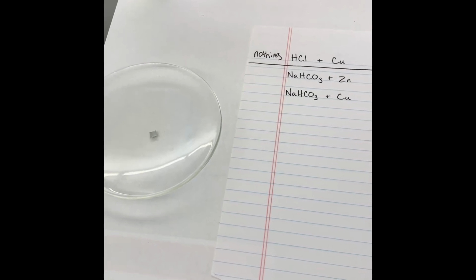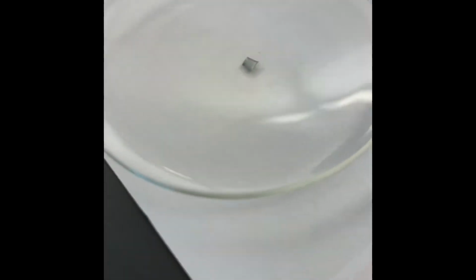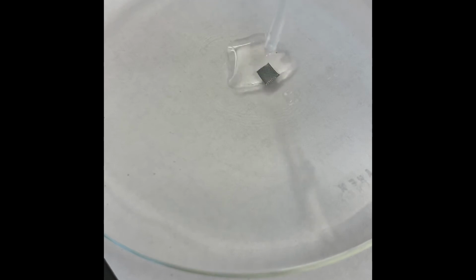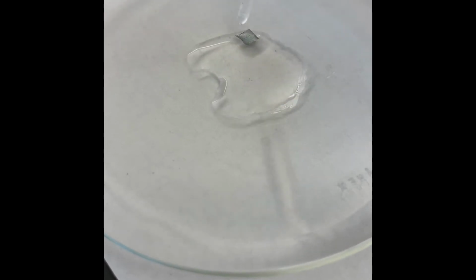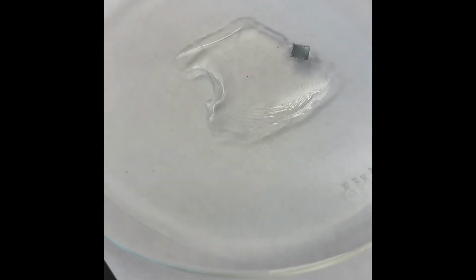Right, here is the sodium bicarbonate and the zinc foil. Okay, not much happening here.